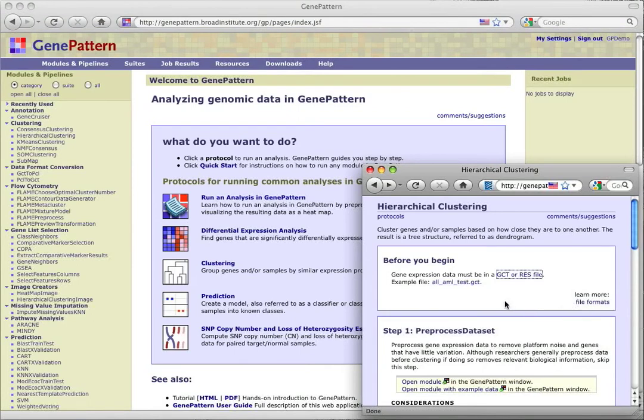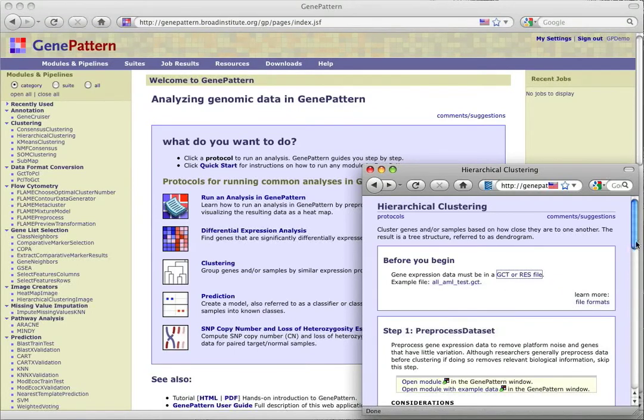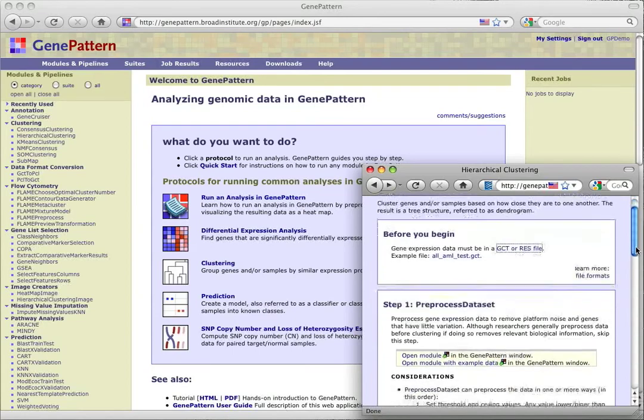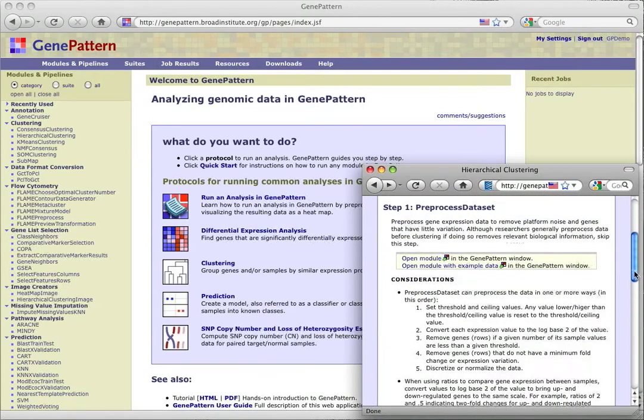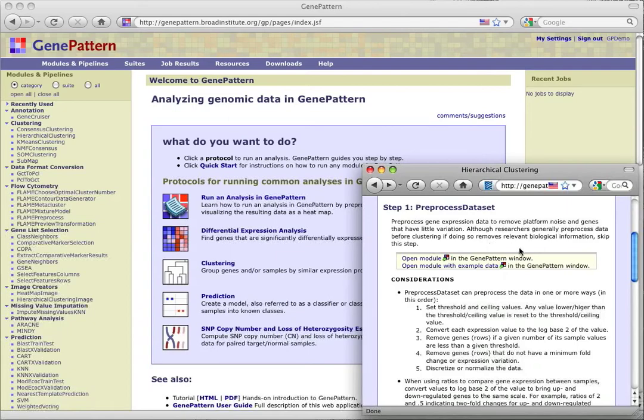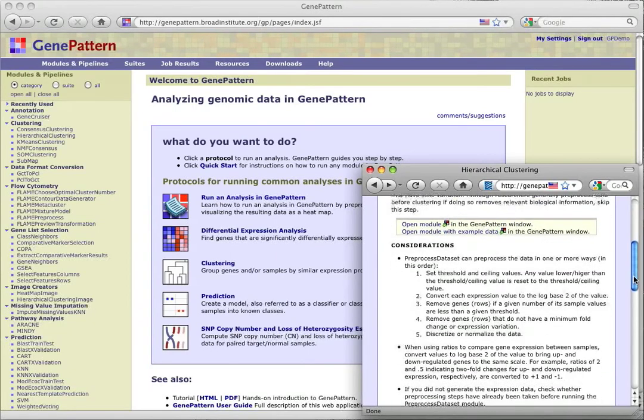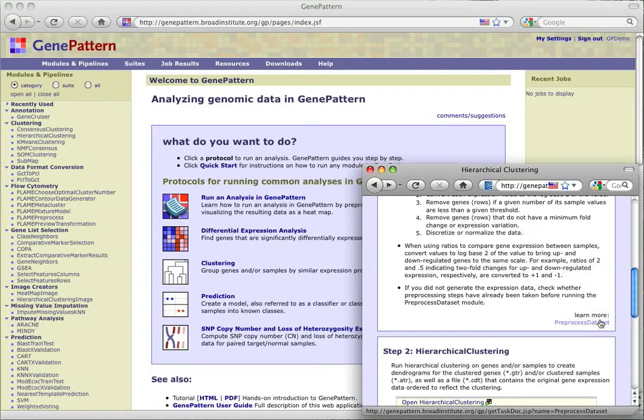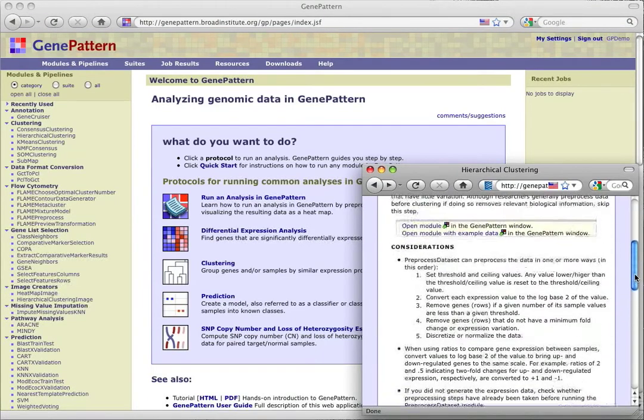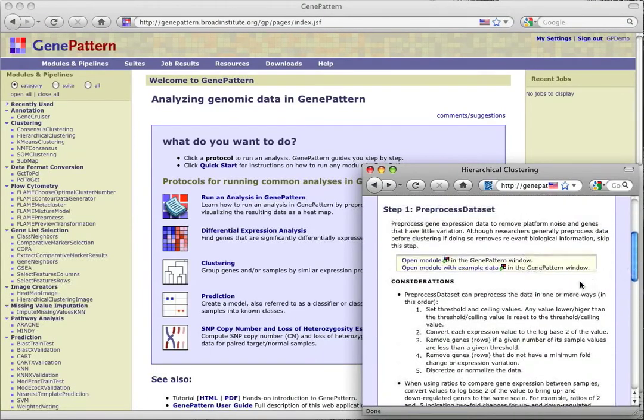For our example, we'll use the provided example .gct file. Our first step is preprocessed data set. The protocol provides us with a summary of the module, considerations for running the module, a link to the full module documentation, and options to open the module without any data loaded or to open with the example file loaded.